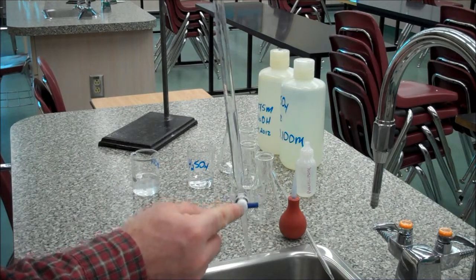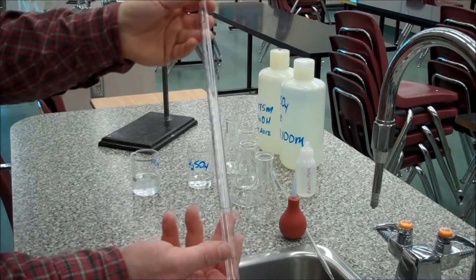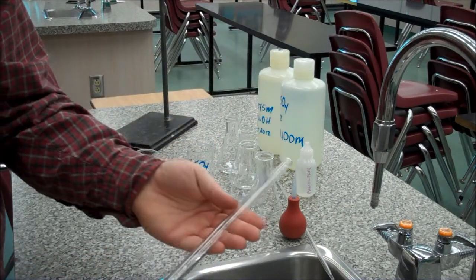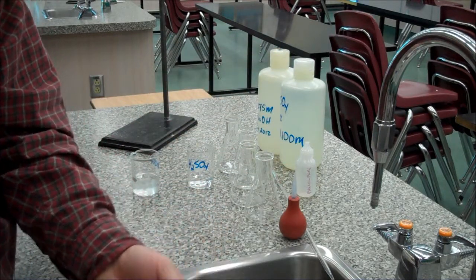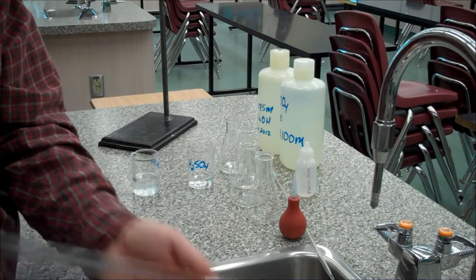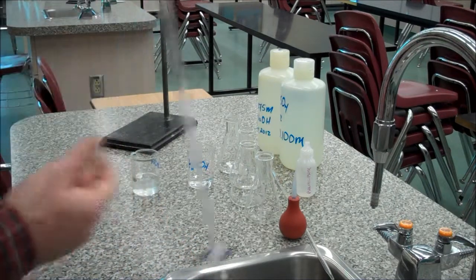So we close this, and then we dump this into the waste. The waste is the sink. This is the material that's found in Drano. Anyway, so it's fine to go down the sink. And we roll the burette as we dump it out. And that is equilibrated.